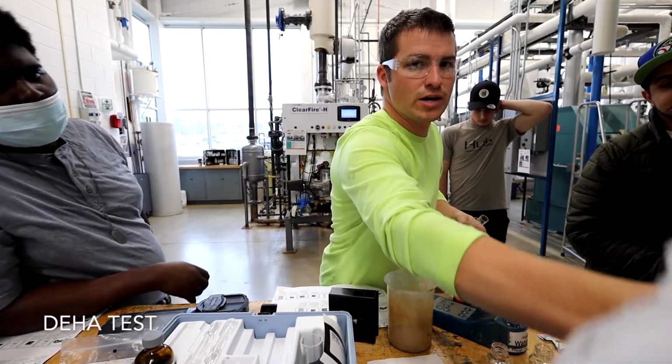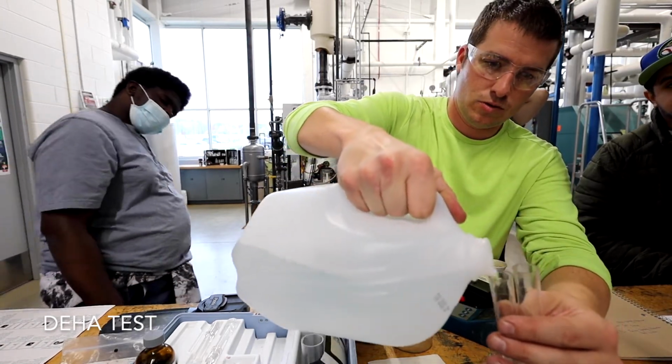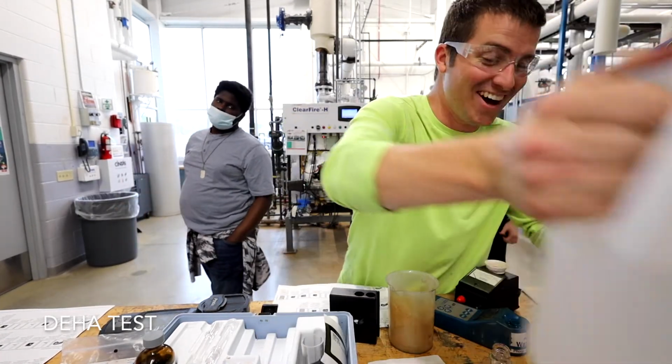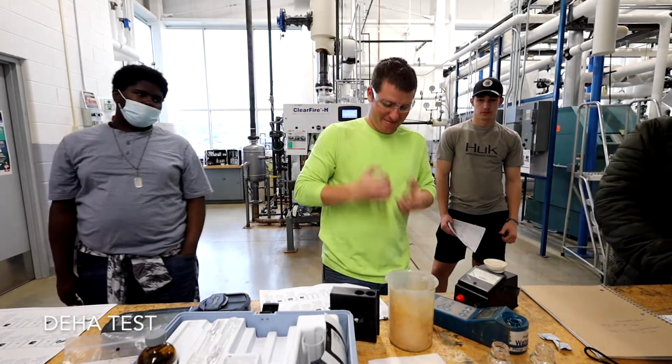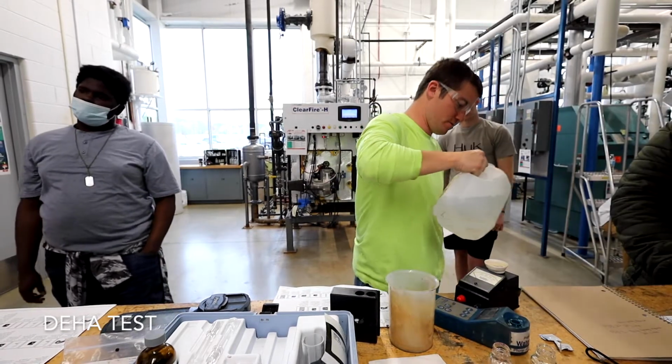So let's rinse those right now with some blank or distilled water. It's got nothing in it. Technically, it is blank. All right, we'll do it once more just to make sure.